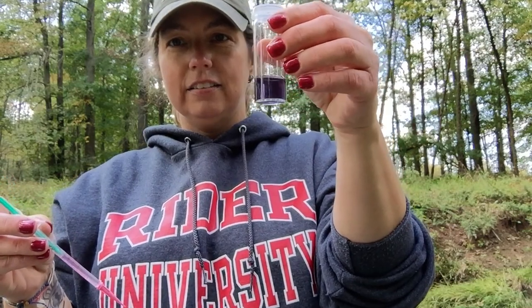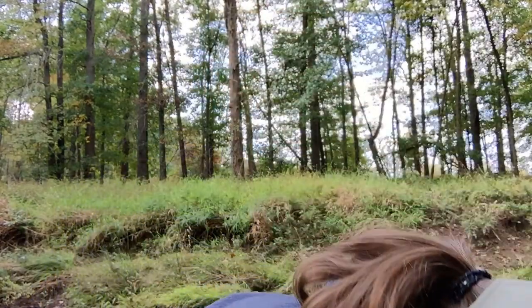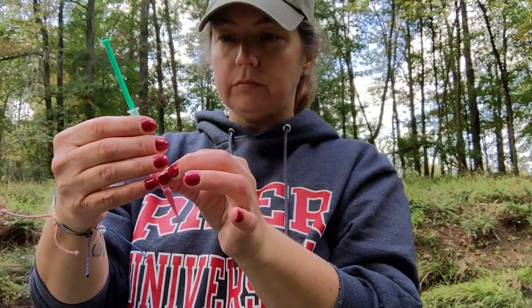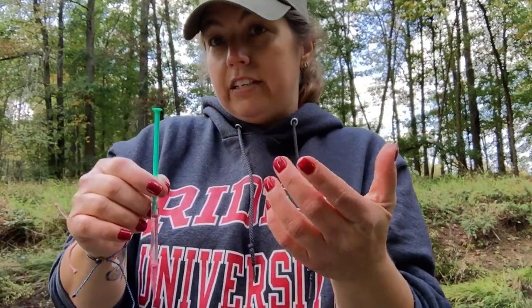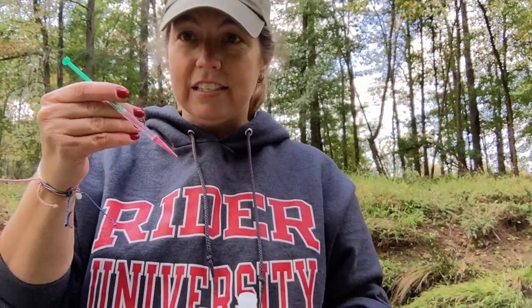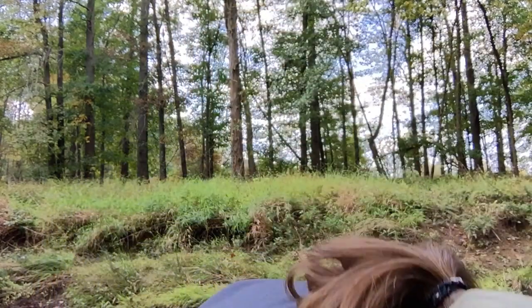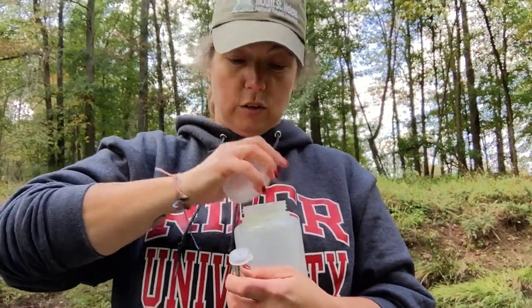There you go - yep, that's a purpley color. What the test kit tells you to do is read the ppm here, and it's about 40 ppm, so that's what we're going to write down. You don't squirt this out into the creek - you put it back in the titration tube, and the waste goes in the waste bottle.